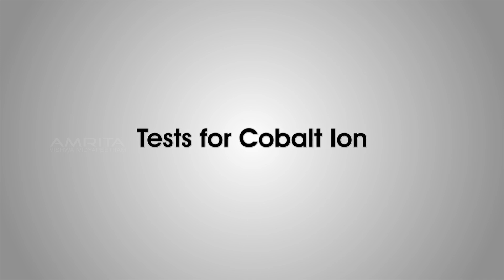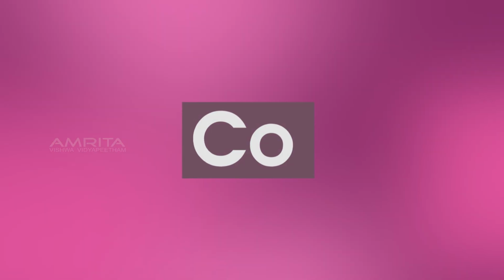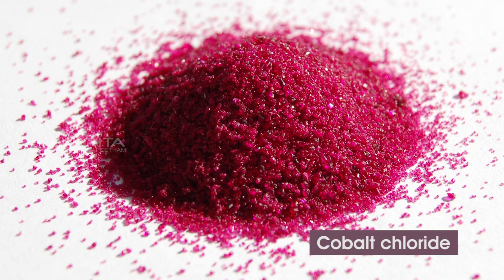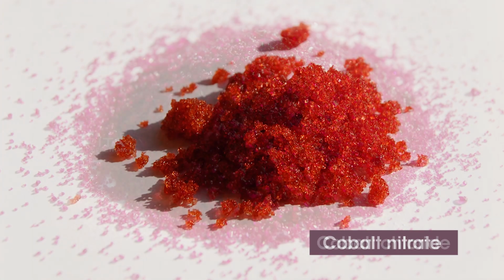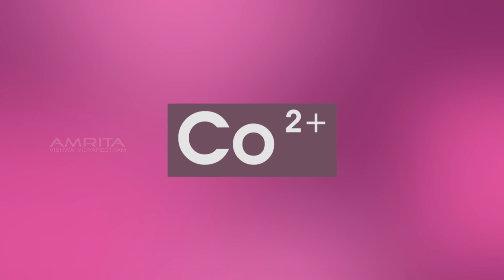Tests for Cobalt Ion. Cobalt is a chemical element with symbol Co. It is found in various salts like cobalt chloride, cobalt nitrate and cobalt carbonate as the cobalt-2 positive ion.